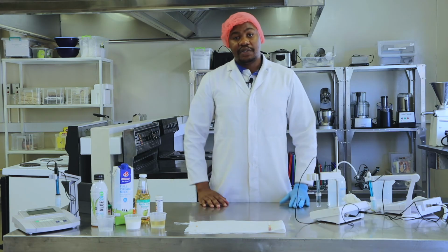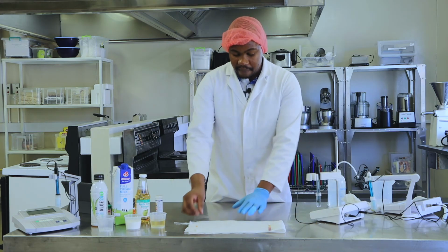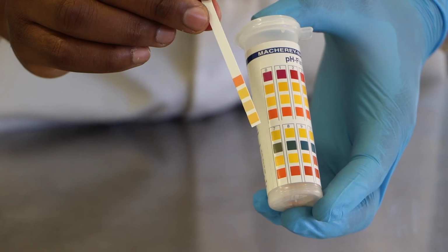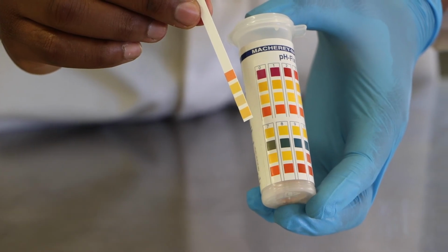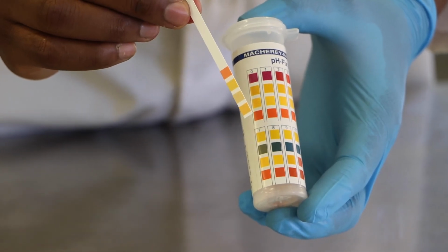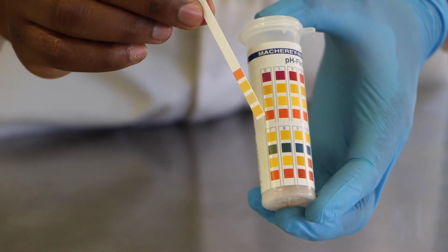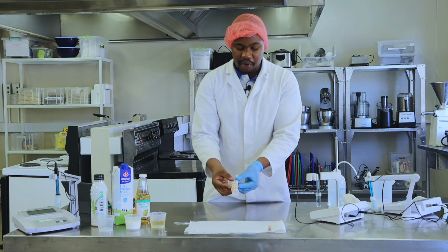So what did I find out in the test strips? When I look at this test strip here, it gives me 4 colors. So here, it's red here. This is pH 3, and then here I already got 2.9.